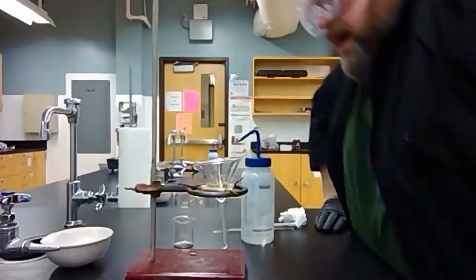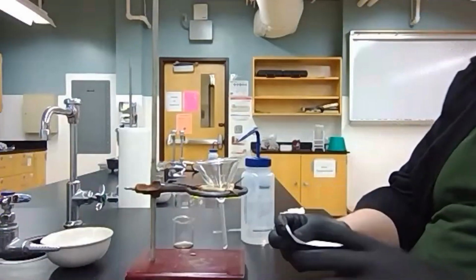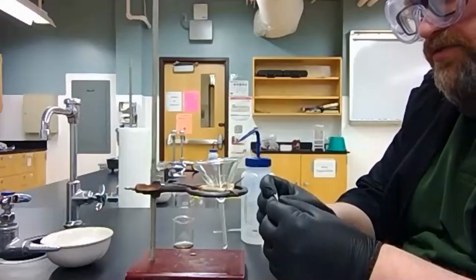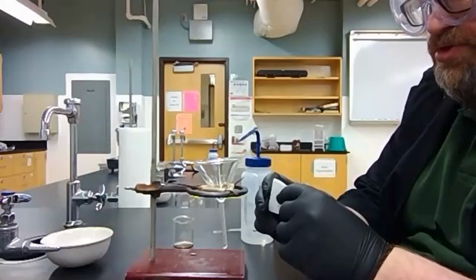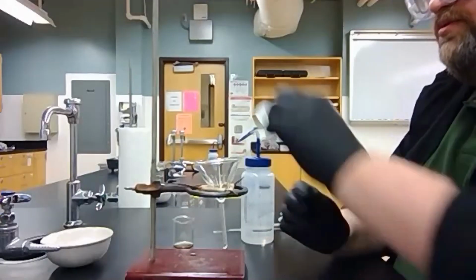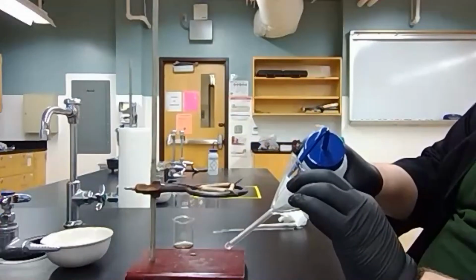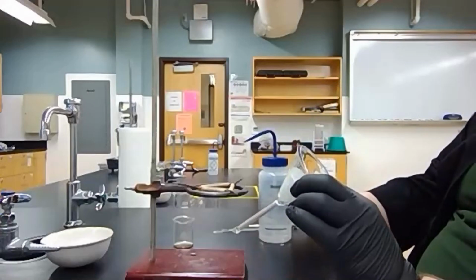Okay? So I'm going to start by, again, preparing my filter paper by folding it in half down the diameter, and then in half so that I get my cone. I'm going to gather 3 of the 4 edges together, form a little paper cone, place it into the funnel, and use just a little deionized water to adhere it to the funnel itself.